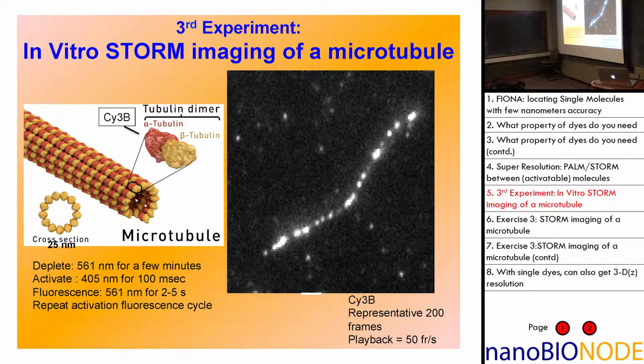Because it's two, it'll be in general somewhat higher, and it'll be wider. So what you do is, when you're going to fit these, you have to make sure that it looks like a single point spread function.